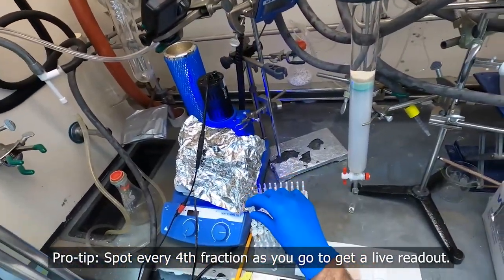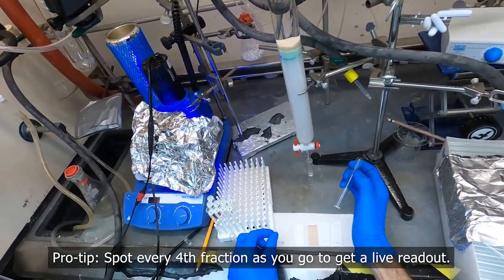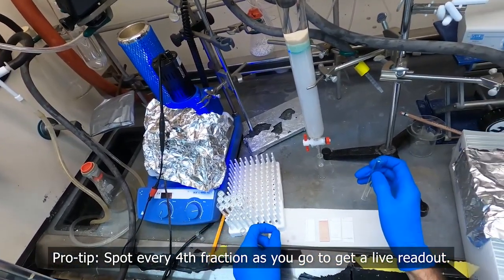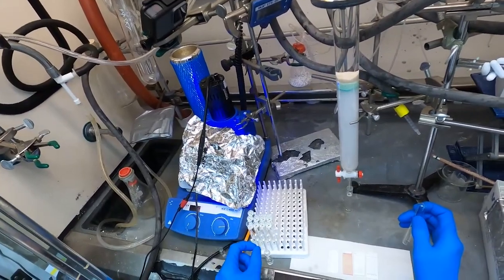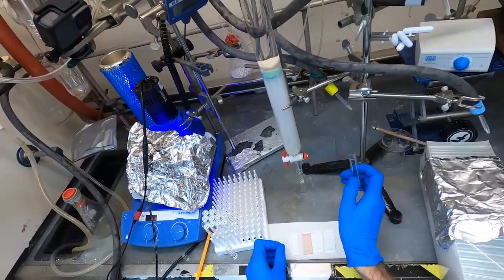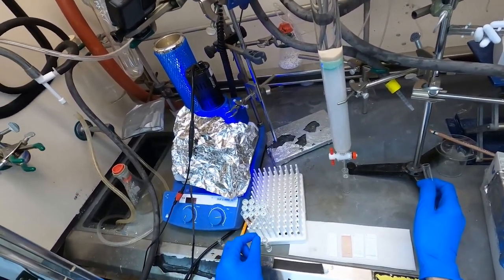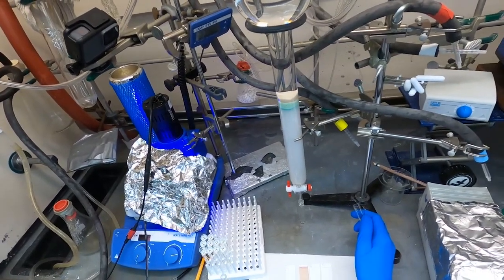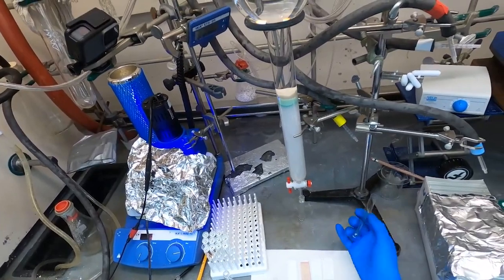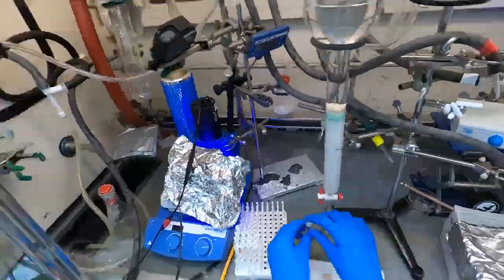And I like to check the progress of the column as it's running. So I have this little grid plate here that I've made. And what I'll do is I spot every fourth test tube as I'm running the column. And I get kind of a semi-live view of what spots have come out yet and which ones haven't come out. And in this case, the very first spot I should see should be my desired product spot.